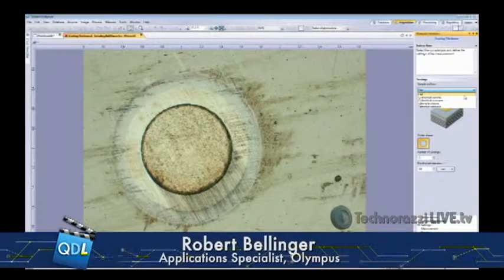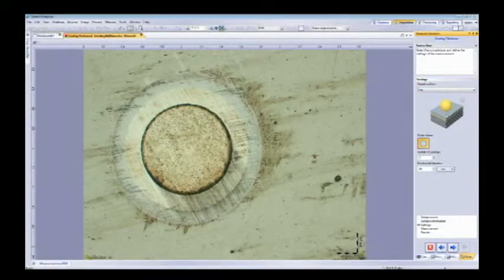The settings for this, we can work on a flat image. We can also work on cylindrical or concaved. We just need to select what kind of material we did this work with. This one was a flat one. We type in the number of coatings. We type in the diameter of the grinding ball. And we just hit next.